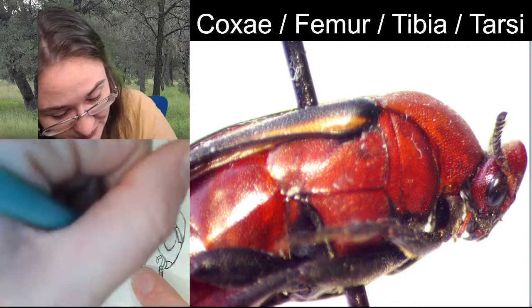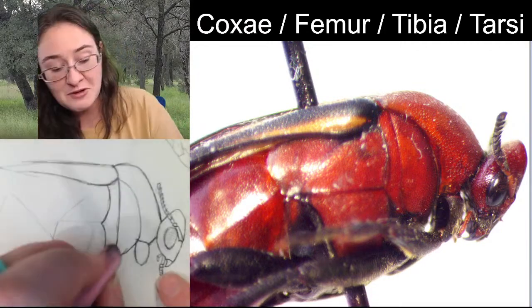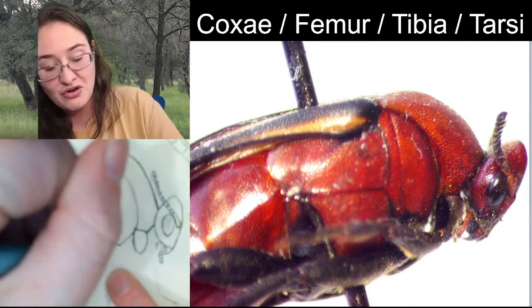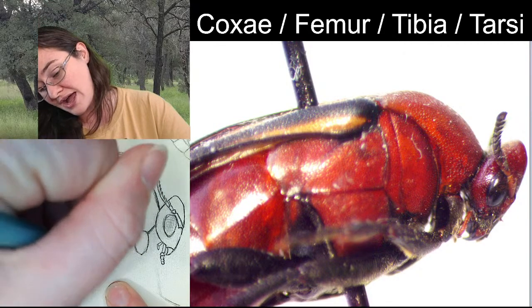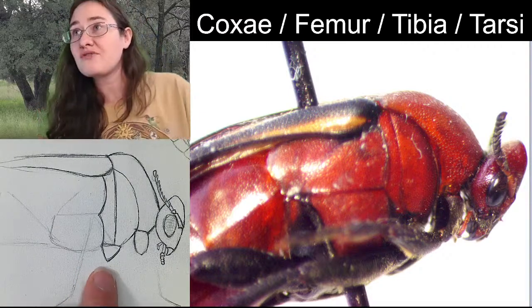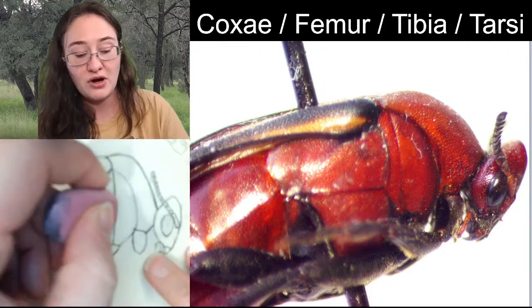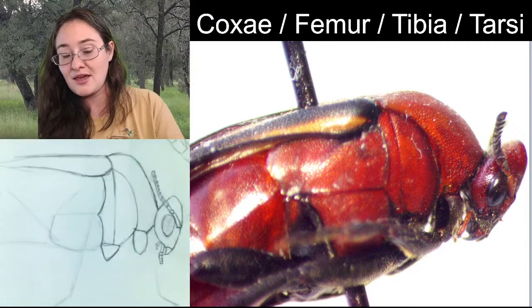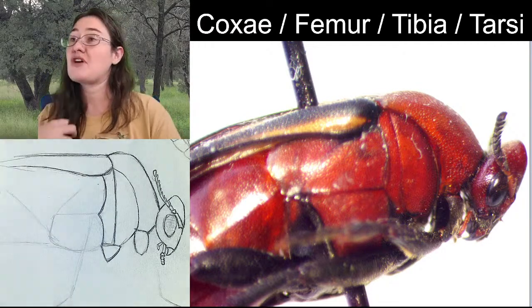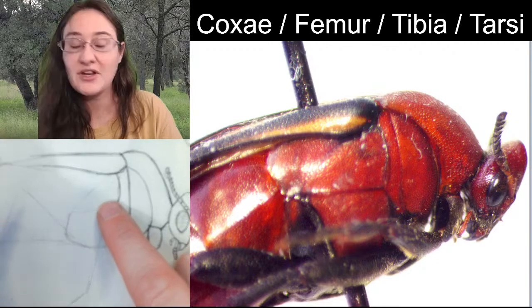And then something along those lines. And this bottom part right here, now that you see that this section is flat, that's actually going to be where the middle coxae is. And it's going to be kind of this triangular shape. We can't see it because it's underneath the front leg right now. So I'm giving you an approximate shape. We might be able to turn the beetle over when we're doing legs to see if there are any corrections to that shape that we need to make. All right, very good.